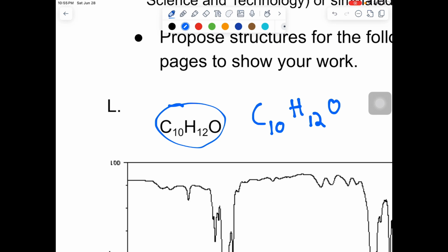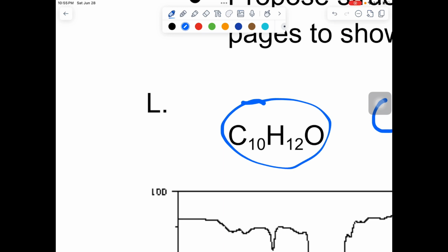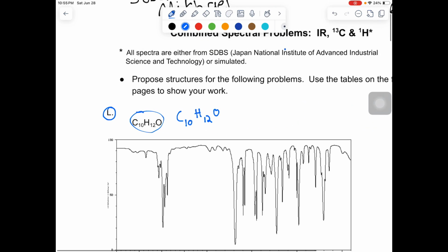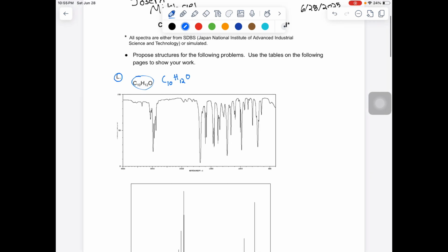And I know in the assignment rubric, I would need to include the assigned number or letter that was given to me. There was an assigned letter, which is right here, which is supposed to be L. So as we move forward, I will go to the next step and talk about the problems and talk about the spectrum.